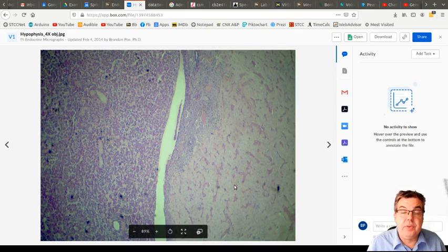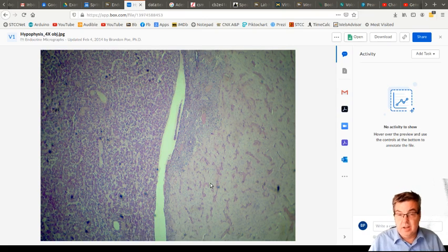And so this tissue looks lighter than this tissue because it's basically just a bunch of axons, and maybe some other components of nervous tissue. So they don't stain as darkly. Some of the darker staining stuff in here might be other neurons, they might be blood vessels, I'm not quite sure. This is fairly low power, not enough detail to make out. And it's not what we're concentrating on here.